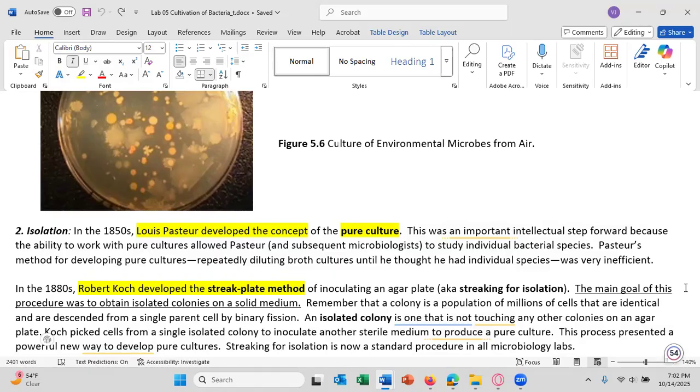You'd have to have an original sample, a mixed culture, and then make many different dilutions of it, and then replicate plate 10 tubes for each dilution. And then you're looking for the one dilution where there's one tube that has growth in it and 9 tubes having no growth in it.